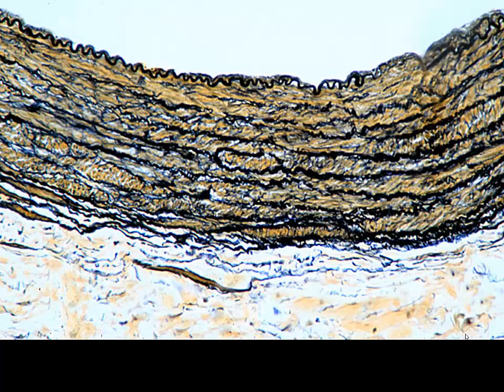Once again, a lot of elastic fibers present here. The yellow is going to be smooth muscle cells, and then we can see again elastic fibers present in our tunica adventitia.